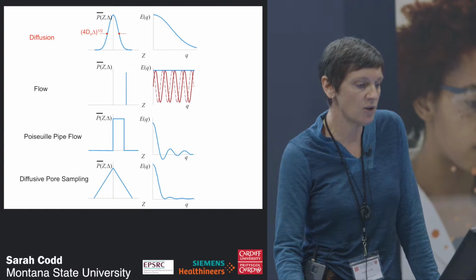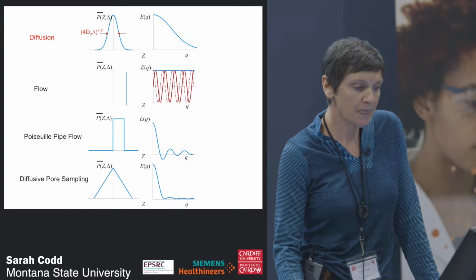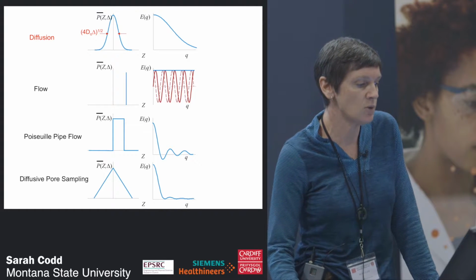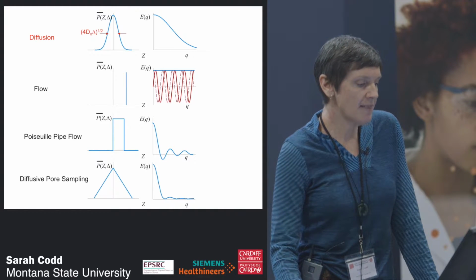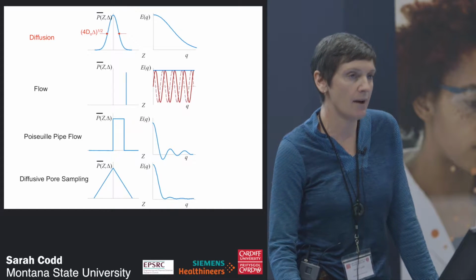maps, as Yang had showed, then by thinking about the phase difference in the data that you acquired in your experimental space, because you were approximating it as a single delta function displacement in the propagator, then you could access the velocity. And then of course this was really beautiful if you start thinking about pipe flow.